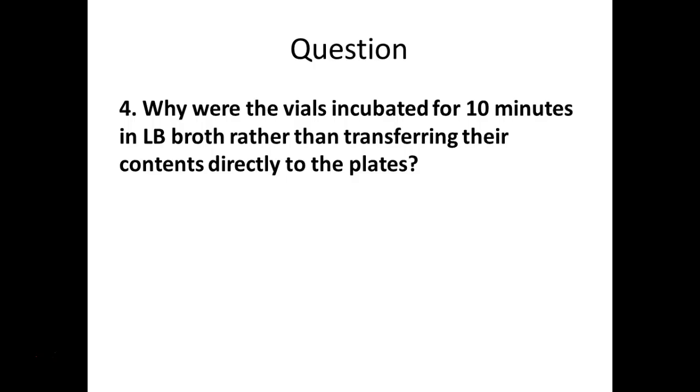So y'all see that? 3 out of those 4 plates contained ampicillin, yes? If we take the bacteria and we plate it right onto those plates without waiting the 10 minutes, will they be able to survive? No. Why not?